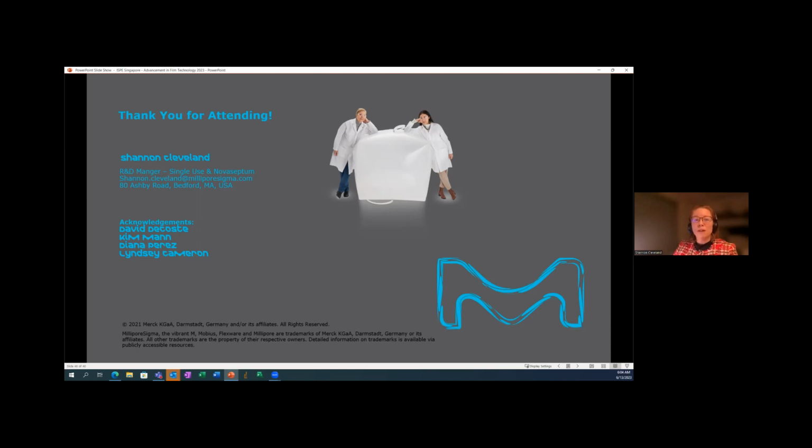We also did some other integrity tests during development that used soapy water to look for even smaller holes during our integrity testing. That was also employed during the test where we did the vibration testing and the ISTA 3E testing to ensure that the bag was integral even with smaller holes. Hope that answered the question, Clinton. I hope so. Thank you.